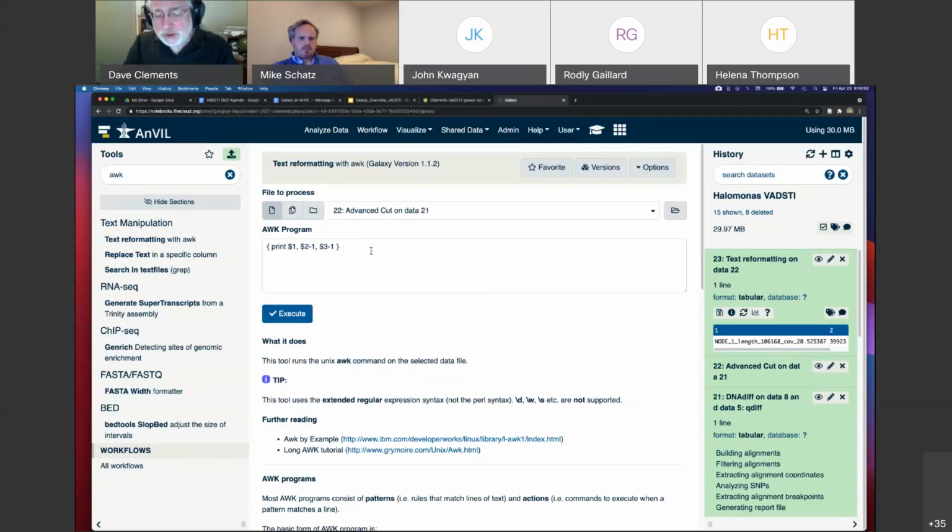Now, here you have a fundamental choice, and Galaxy tends to support both of these in lots of different situations. You can use a tool like awk, which is defined in Galaxy, but you have to learn a special syntax, okay? Once you learn it, you figure out it's not actually that hard to do basic stuff. I have learned awk 15 or 400 times in my career. So I don't remember how awk works, but every time I need it, I think, okay, I can figure this out. Same thing with table compute. It takes a bit to get the hang of it the first time, but once you get the hang of it, it's easy to relearn.